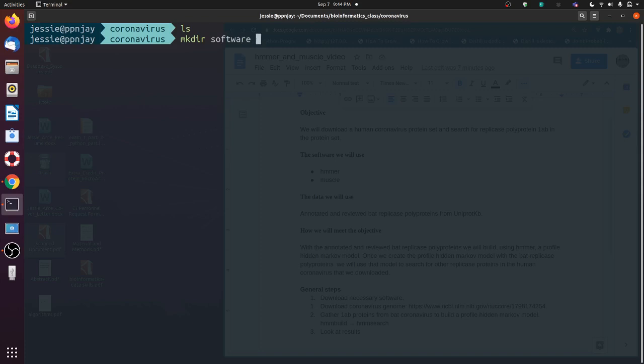That's where all the bioinformatics software I download is going to be located. And then I want to have my data in a separate directory, and the results that I make with the software in a separate directory. And then if I write any scripts to automate my workflow, I'm going to create another directory called scripts. Make directory, list, and then I have my data directory, results directory, scripts, and software.